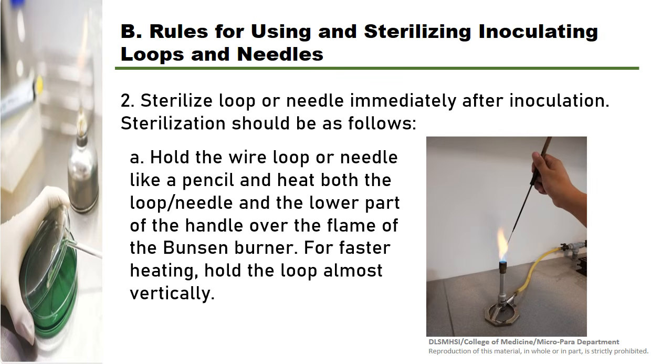Let us proceed to the sterilization procedures. So first, you hold your wire loop or needle like a pen. In this way, it leaves your little finger free to hold your screw cap or tube cover or, let's say, cotton plugs while working.